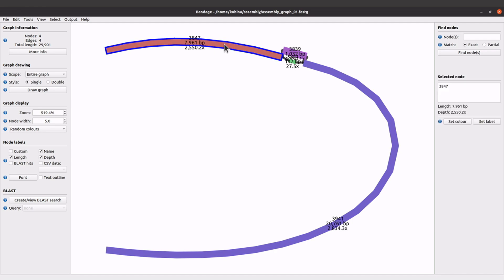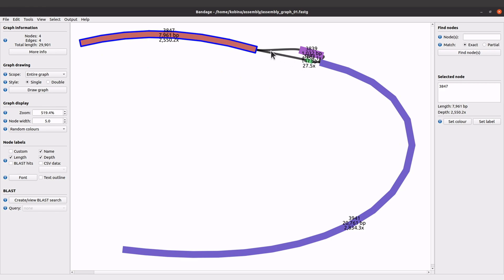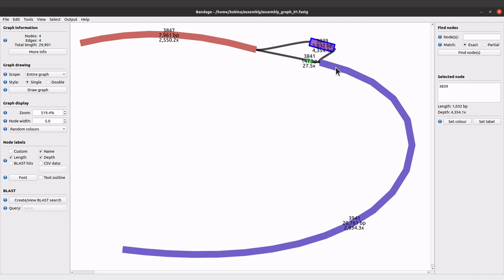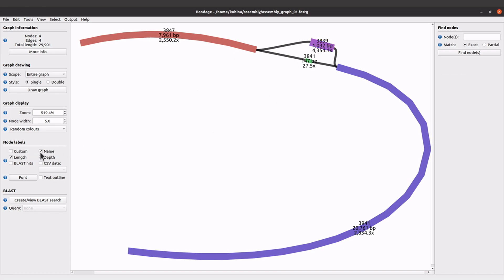depth, etc. You can also copy sequences — if you have some contigs of interest you can copy them and BLAST them. You can move nodes; these are the nodes and you also have edges. You can click and move them about. Just explore — this tutorial is an introduction, so try with other datasets, explore and learn.